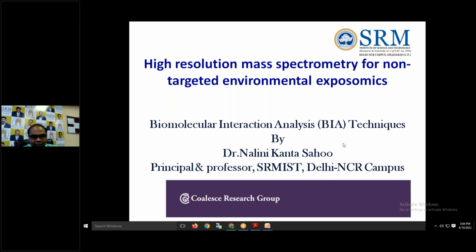So we need to detect and identify their presence: the environmental contaminants and pollutants which may cause some disease, some allergy, or some unwanted or adverse reactions. Those are called exposures, and how to find their presence in the environment, that is my talk today.